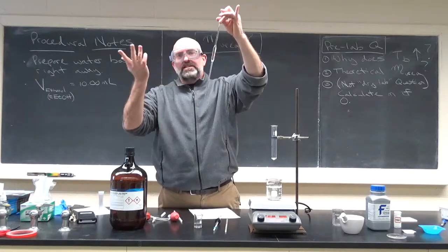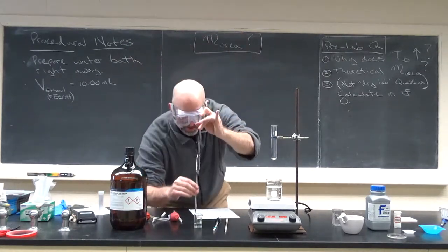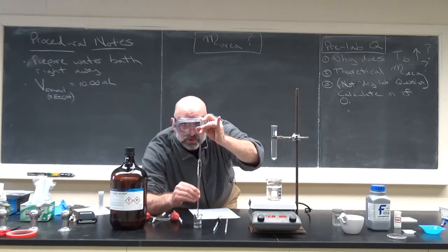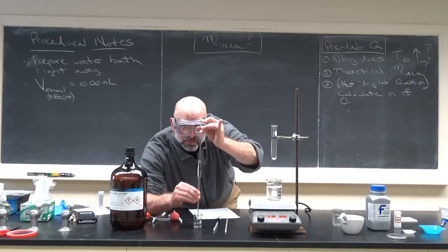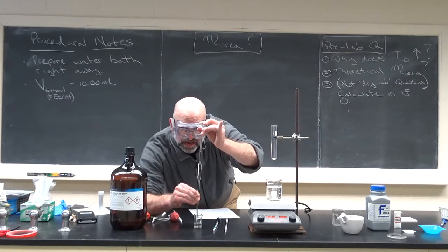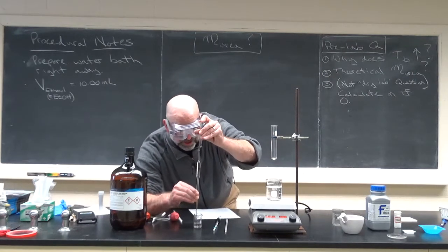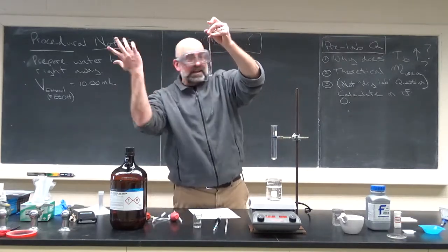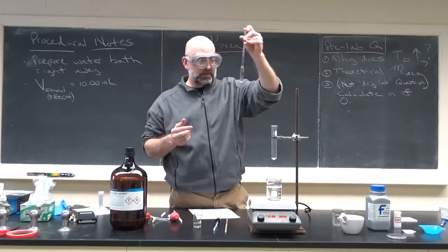And you don't have to sit here and watch me do this. Maybe I won't do it perfectly, which is okay. You move your finger, let a little air in so that the atmospheric pressure pushes it back down. And you can do that slowly. Sometimes students are better at this than I am. There we go, it's going down. And for the purposes here, that's actually pretty good. Yeah, so the meniscus is, I did that perfectly. That's rare that I do that on the first time.